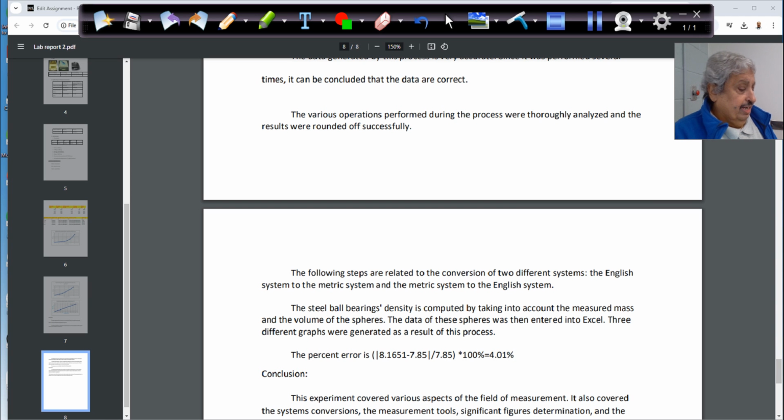Repeating myself: the 3 dimensions of this rectangular block. Are those the only ones? Those are the only ones given. Balls we have plenty. So the mass and diameter of these spheres, and the volume of those 2 graduated cylinders, 2 liquids here.